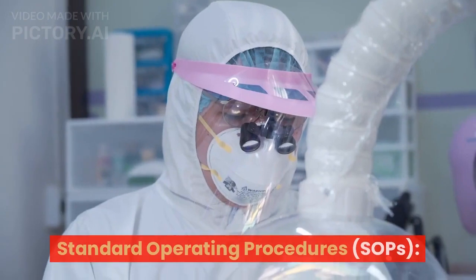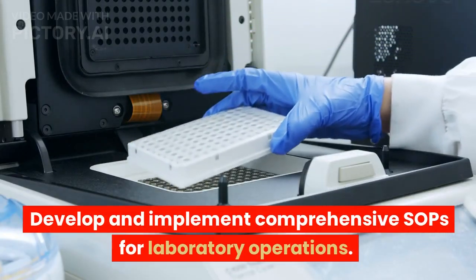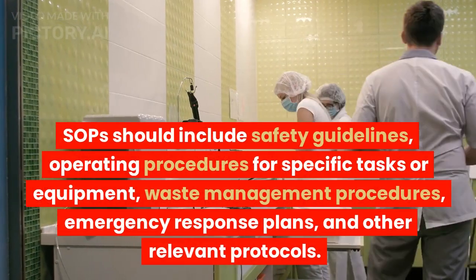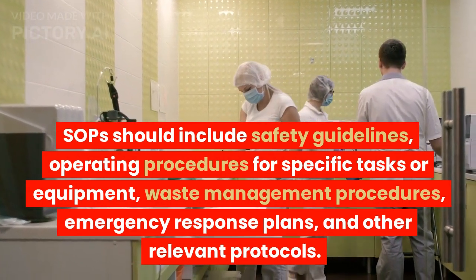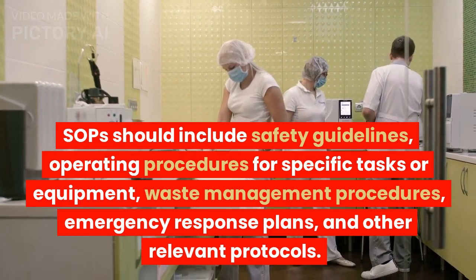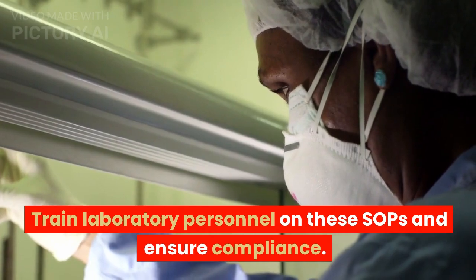4. Standard operating procedures, SOPs. Develop and implement comprehensive SOPs for laboratory operations. SOPs should include safety guidelines, operating procedures for specific tasks or equipment, waste management procedures, emergency response plans, and other relevant protocols. Train laboratory personnel on these SOPs and ensure compliance.